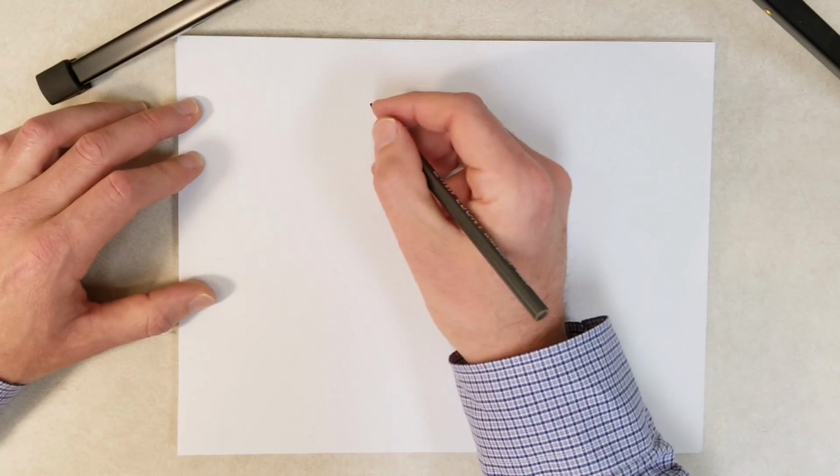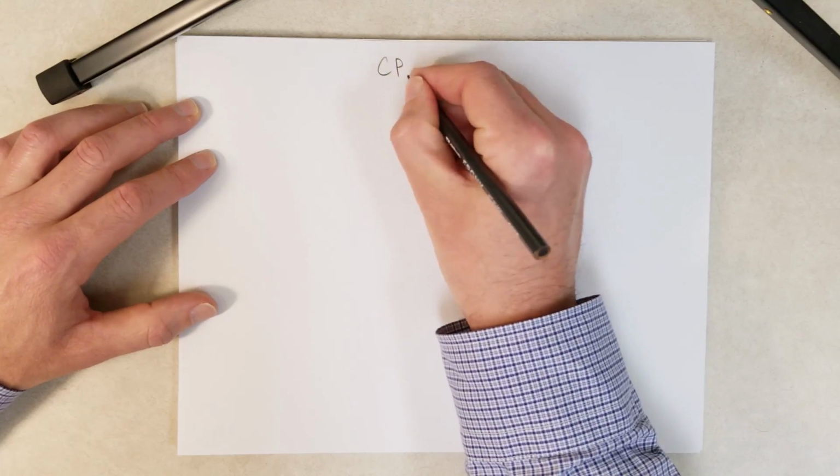So I really like this technique, and let's take a look at how it works. And then, eventually, I'm sure it'll be used to study CPD formation and nucleotide excision repair in humans. So, okay, what is CPD-seq? What does it do?